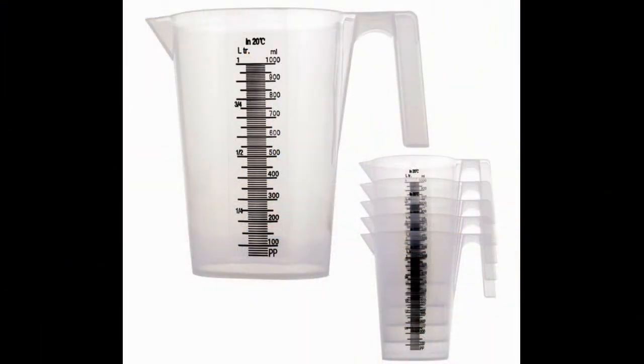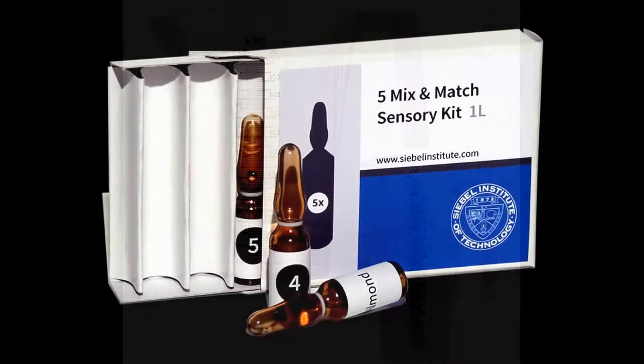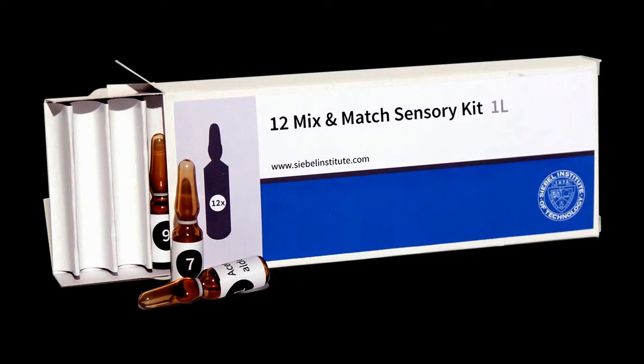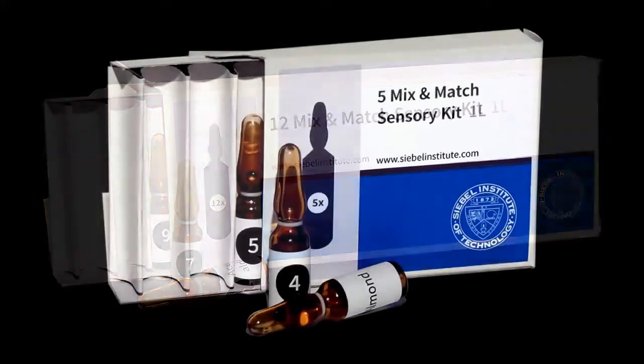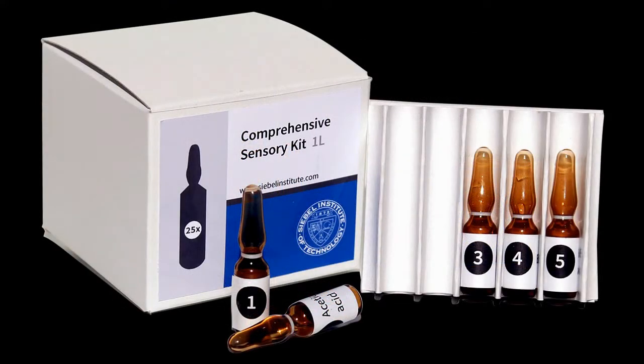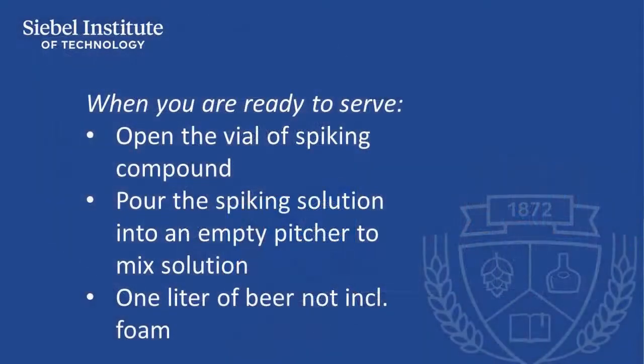You require a clean pitcher with enough volume to hold over one liter of liquid, and accurate graduated measures showing a one liter level. Finally, you need enough vials of Siebel Institute sensory training compounds to spike a sufficient amount of beer for your panelists.